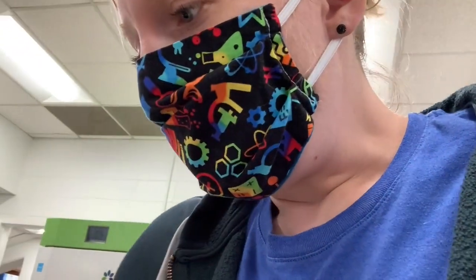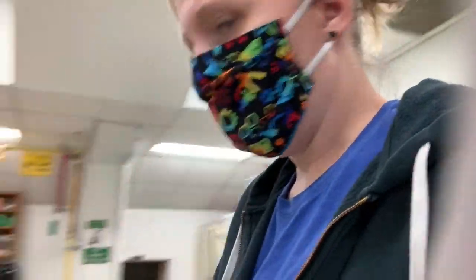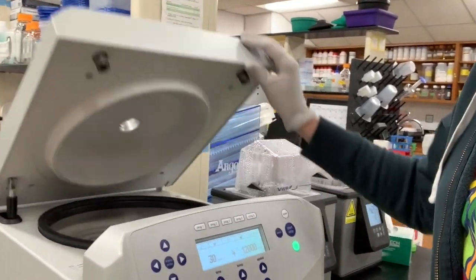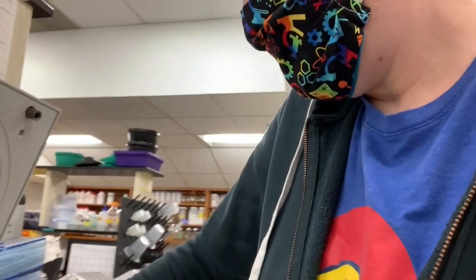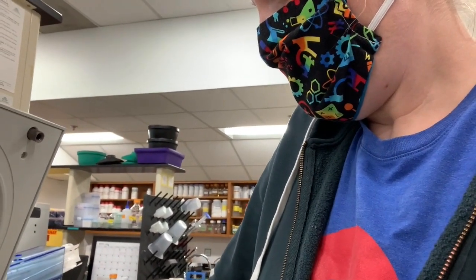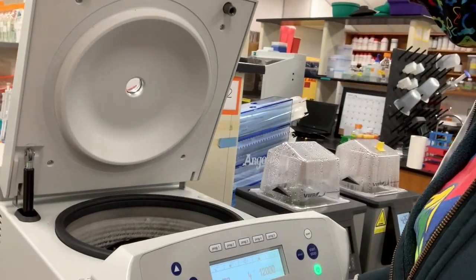You may be able to see a precipitate at the bottom. So like a little whitish clear pellet. I'm going to put these in the centrifuge. So I'm going to open it up. Take off the lid. It's a little hard to do one-handed. And then I'm going to put in my samples.